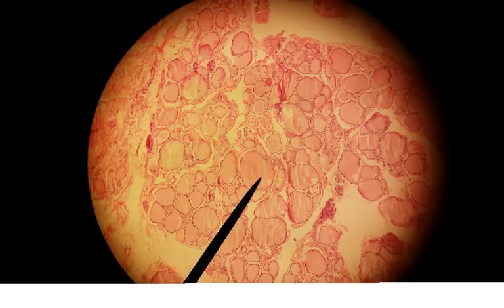The round structures are the thyroid follicles and this is where those T3, T4 collectively called the thyroid hormone are made. And we have two parts. We have the cells that make essentially the wall of the thyroid follicle. This is simple cuboidal epithelium and then we have all the liquid that's inside and that is called colloid. Anything that is not a part of those thyroid follicles, these cells that are kind of in between, these are either called C cells or parafollicular cells. And that is where calcitonin is made.